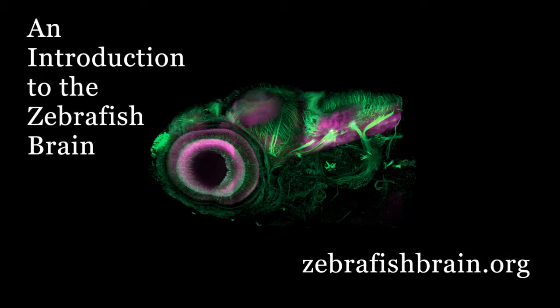This is an introductory movie to show the basic anatomical subdivisions of the larval zebrafish brain. To help orientate you, the movie will show bright field images followed by three-dimensional reconstructions of confocal data.